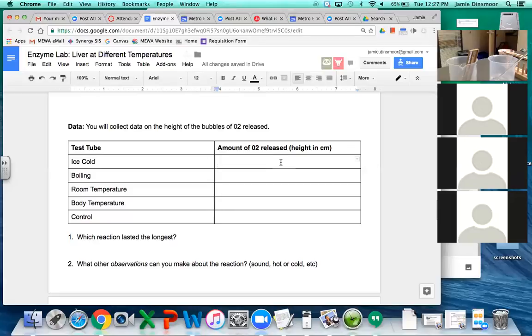Thank you so much. Seriously. Yeah, it's an ethanol flame. Is your flame starting? It's very interesting. Yeah, just set it there. Okay, so we got to start. What happened to them? Where are they? We got to start doing this. I told her to come.